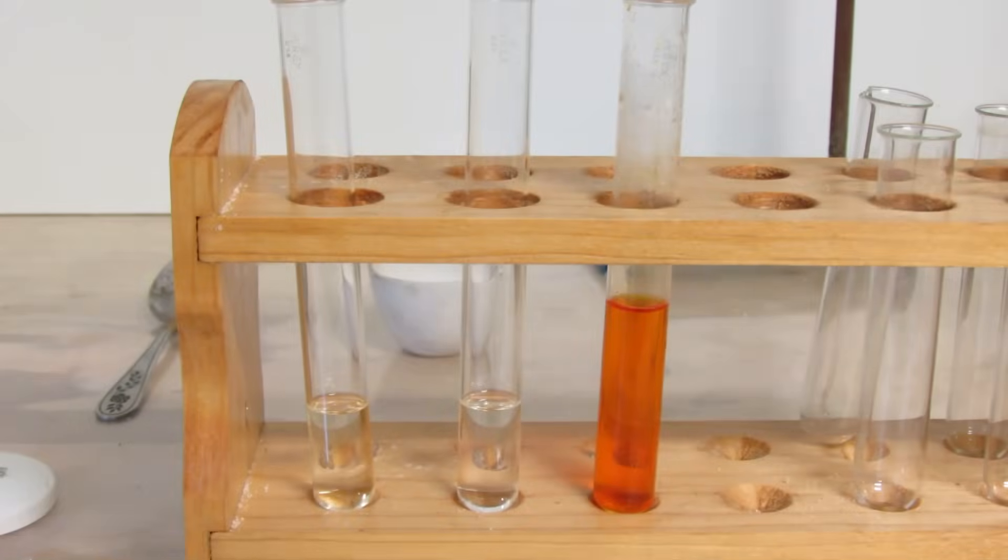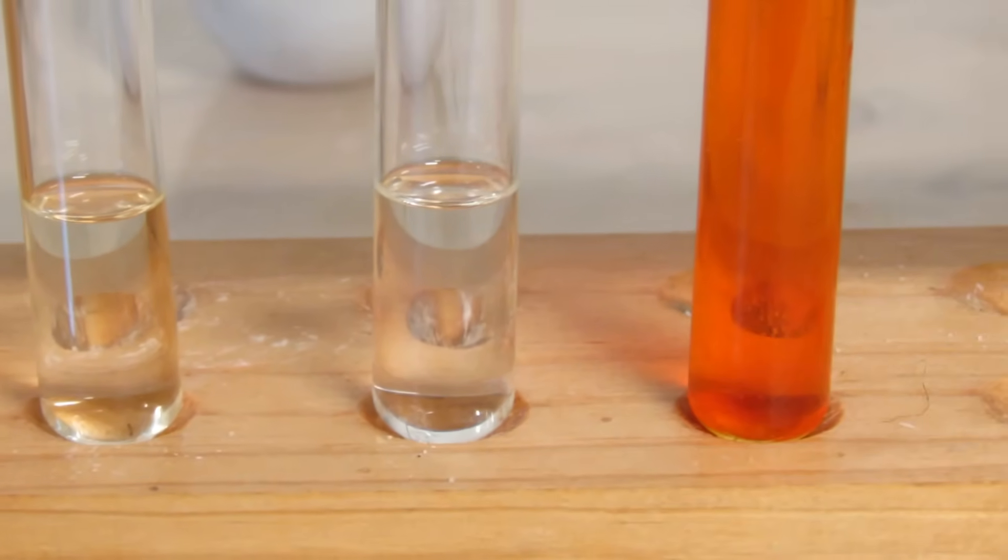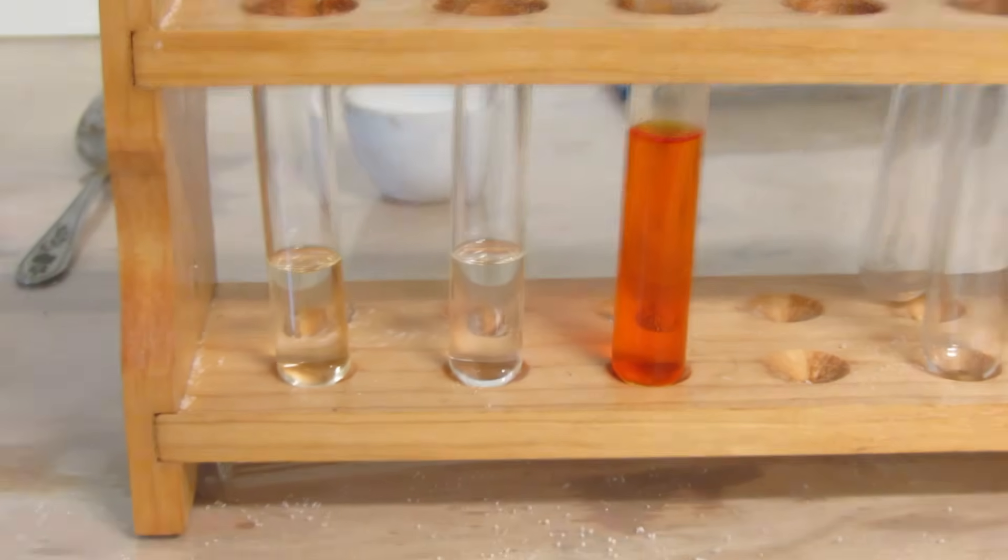Here I have three test tubes. On the left, I have an alkane molecule. In the middle, I have an alkene molecule. And on the right, I have a fairly concentrated bromine water solution.